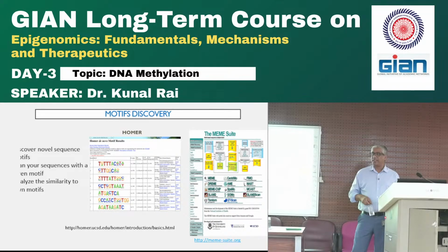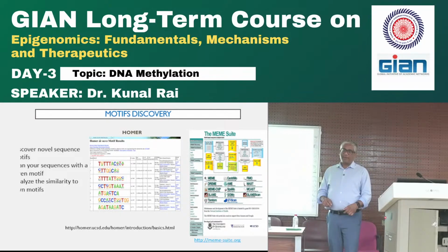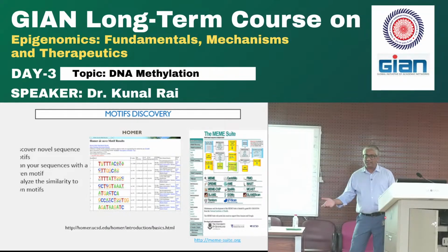Gene set enrichment pathway tools. There are tools called ChIPseeker, Enrichr. You can use them, and that's it. I'm not going to do the lab with you, so I'm not going to go into this, but I'll send you the slides. After this, there are all the tools. Here are the codes. You can use this code to download the software, and if you had a BAM or FASTQ file, you'll be able to run it and come to what I just showed you. There are all of these commands here. This is what I run the PhD students in my lab through when I do this. We'll not worry about any of these. We'll get to this tomorrow.